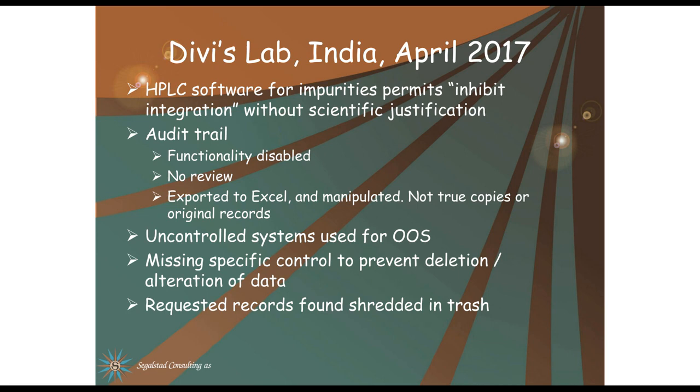One audience member asks, "We don't have a LIMS and we don't plan on getting one. So what do we do then?" Well, if you are working in a paper-based lab, what you need is a lot of SOPs, and logbooks for all the instruments and for how to create your reagents, etc. Basically what I've written for the LIMS, but on paper instead. It's not really a big difference in what you need to document, but there is a big difference in how you document it and how easy it is to document.